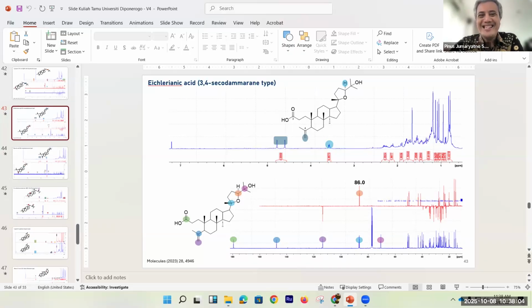Thank you very much, Pak Pinus, for the question. Maybe they have two questions there. I will answer the first question: is it possible to use MixONat for determination of compounds from marine sources? Yes, you can do it. But the first thing, as I already highlighted, is that you have to develop the database.